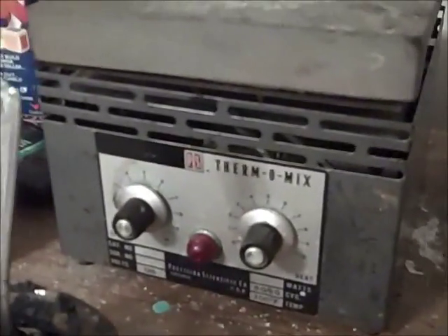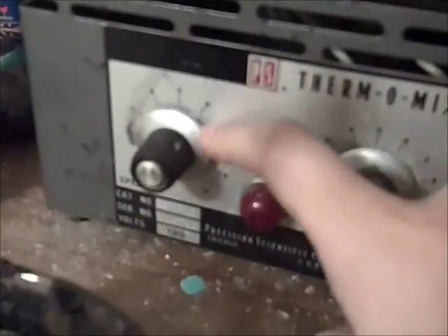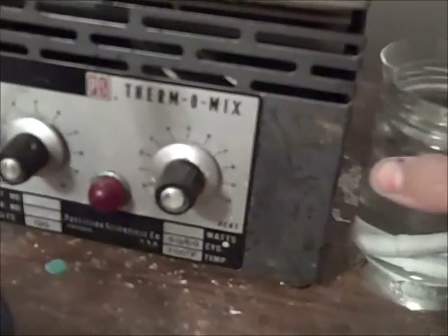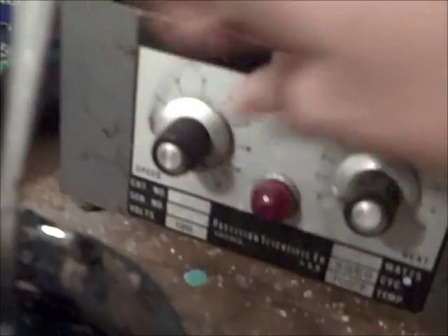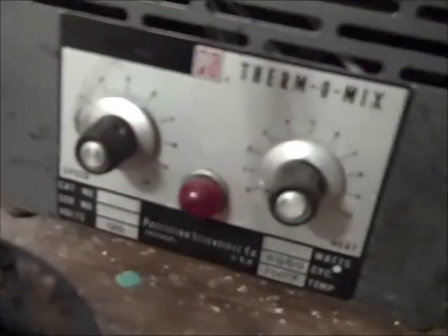Time for some additional notes about my equipment. Here is the hot plate I am using — it's quite good. I got it online as a present, actually. It's a PS Thermomix. It has stirring and heating. I got stir bars to go along with it, which are stored in water to try and clean them off. The stirring goes very fast, actually. And the heater gets up to around 300 degrees Celsius, so it's very good for overall use.